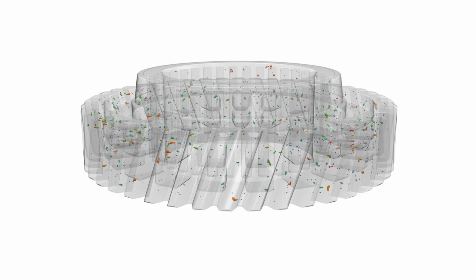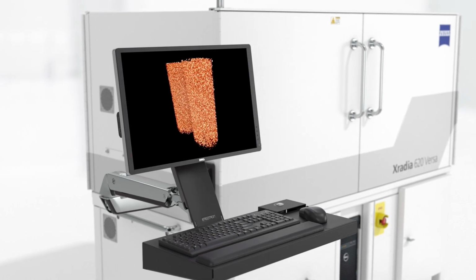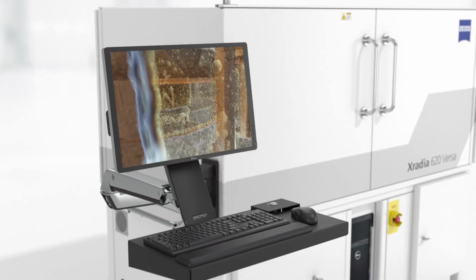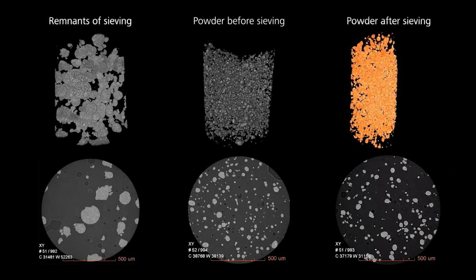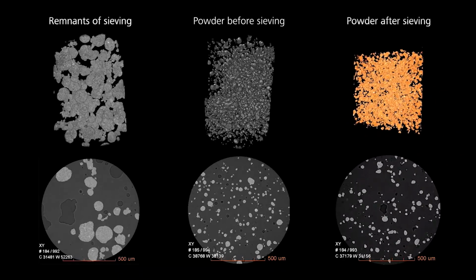But suppose you want to examine the microstructure of parts right after printing without destroying them. ZEISS X-ray microscopy uses resolution at a distance to provide insights that no other technology can offer. Analyze the quality of the metal powder and its distribution directly in the powder bed. Explore the microstructure of printed components non-destructively.